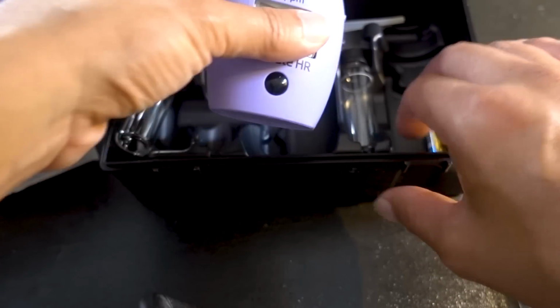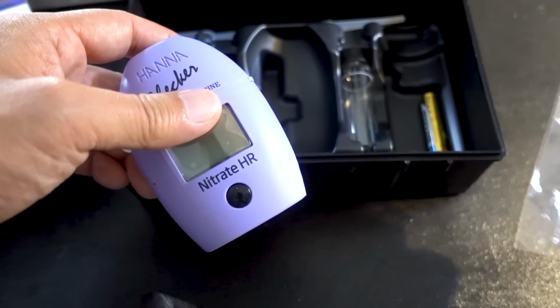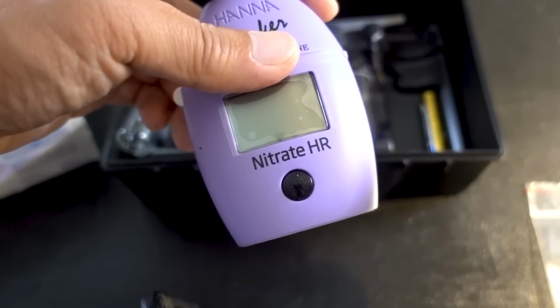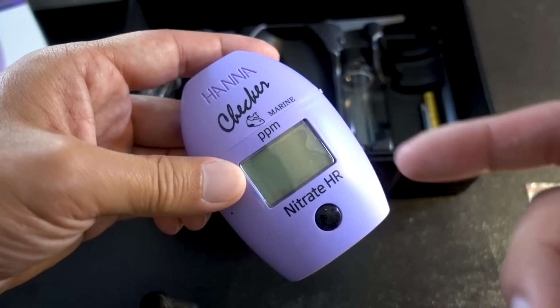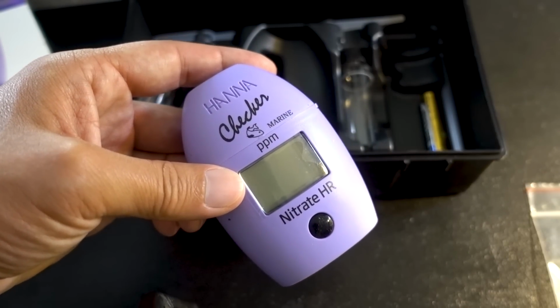High range checker, I got it because I heard some great things about it, namely that it's just one single step like the phosphate checker. Basically, you got one pack of your reagent, add it in, that's it. The only pain point is that you have to wait. With the nitrate test from other brands, you also have to wait for the chemical reaction to occur. So that is not just pertaining to the Hanna Nitrate high range checker.